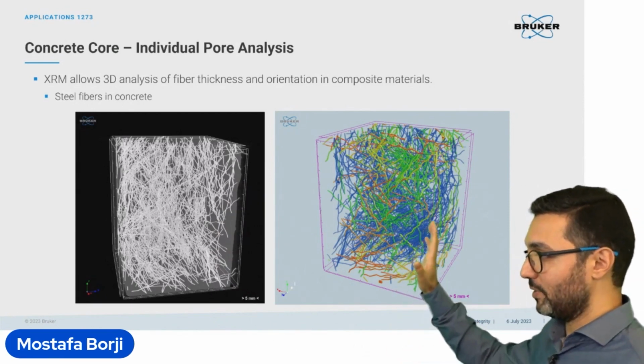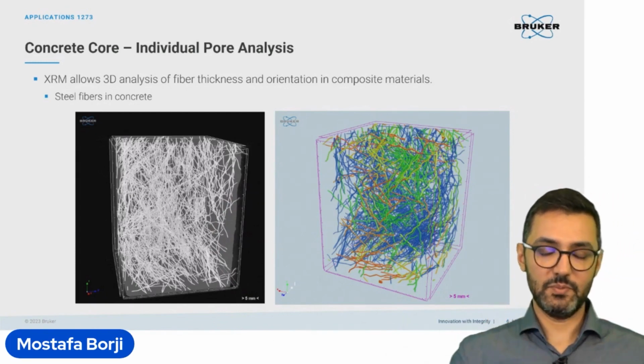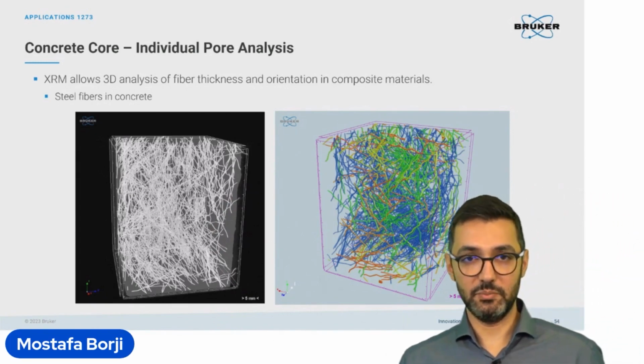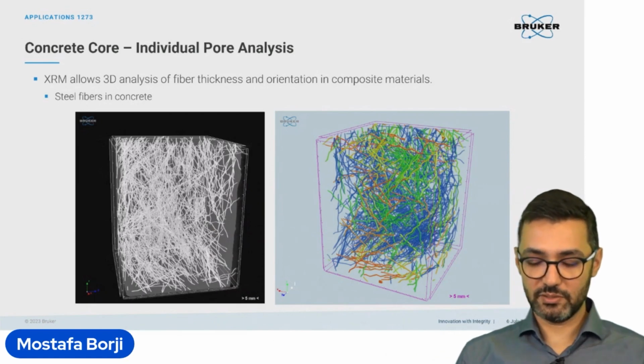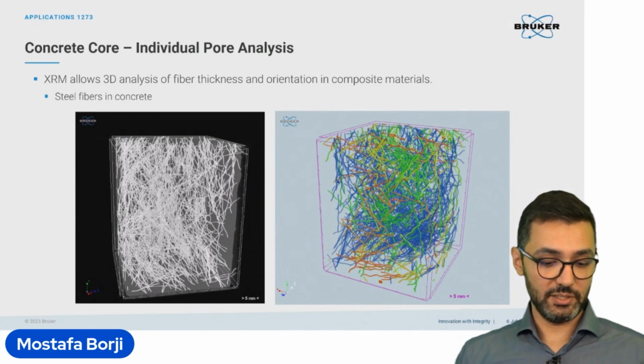For each fiber, we also have a CSV file exported from the measurement software, and it gives us the exact values regarding each of them.